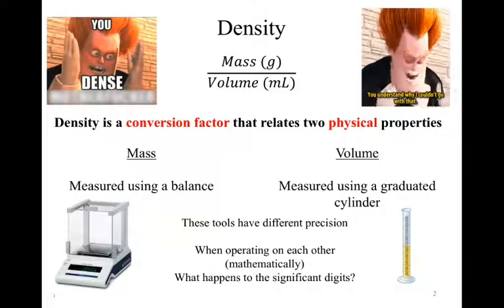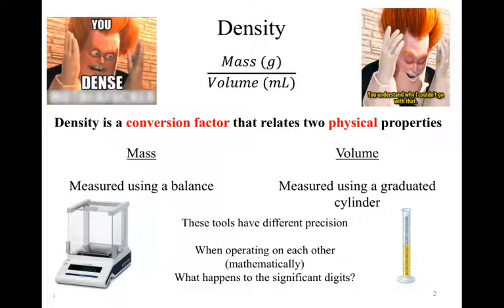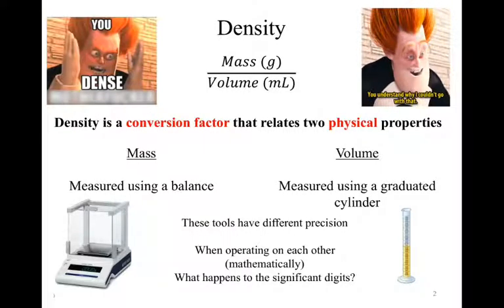Why would you run off with it without calculating the density to figure out what it was? You're already making a guess as to what it is based on the physical observation. You have eyes. Use them in this lab. Take advantage of what you see and allow that, with the density measurement, to help you identify the metal. Don't do it with just the density alone.